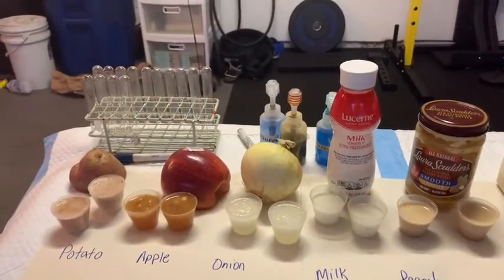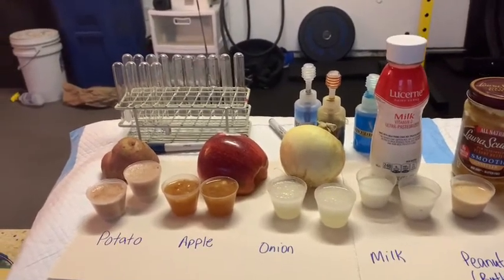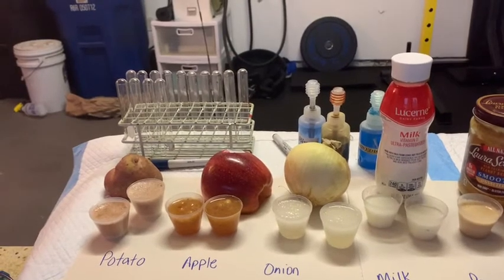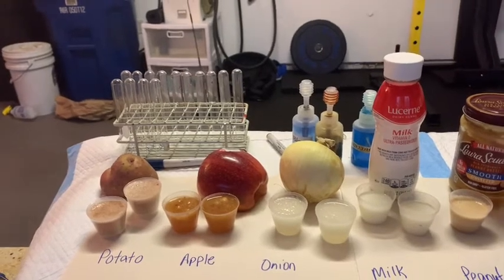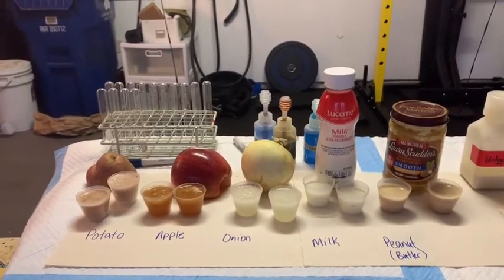One of the things we have to do in this experiment is we have to create juices of our foods. In the olden days, this would have meant taking our potatoes, apples, and onions and grinding them up in a mortar and pestle. But it's modern society now, so I simply used a magic bullet.